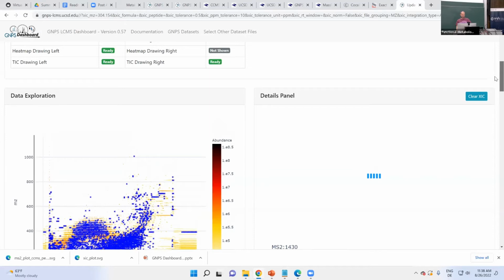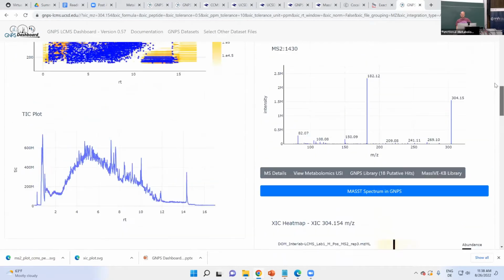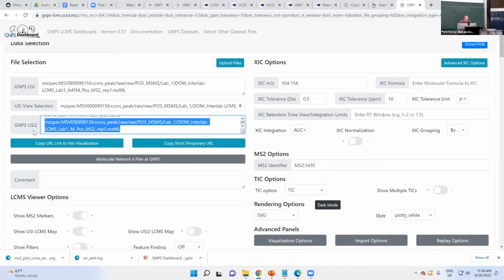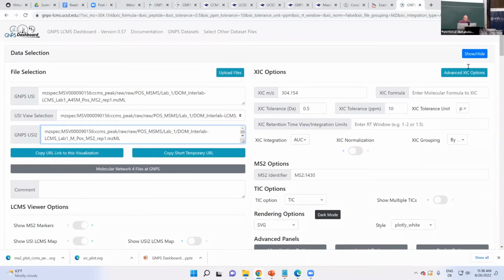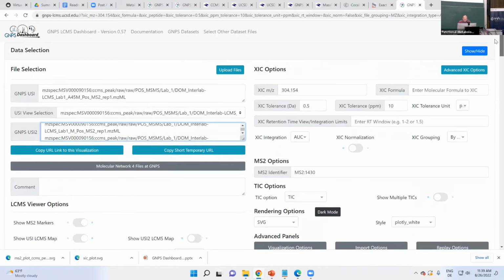Again, it's taking some time perhaps to load the new files. So let's give it a couple of seconds, but after a while I should see this additional file. And I don't know why it did not load all 3. Technically it should be 6 in total. And then I would see what the difference is between the 2 groups. I don't know why it only loaded 2 now. Okay, I'll troubleshoot that in a second.